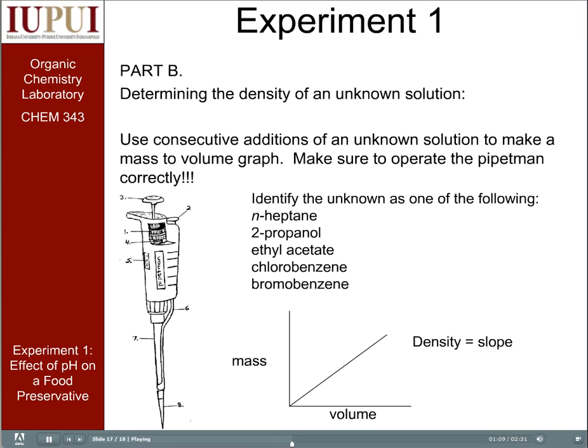So when you've got that thing on the balance, the beaker or the vial, and you add a certain preset amount of liquid, which is one of those 5 liquids on the right, then a certain mass is going to result. You add a little bit more volume, a second injection, and then you end up getting more mass.